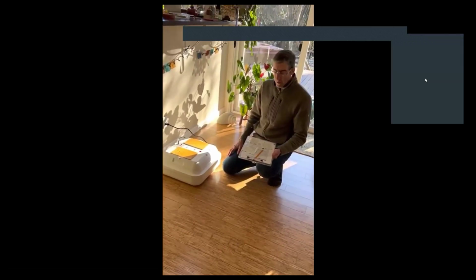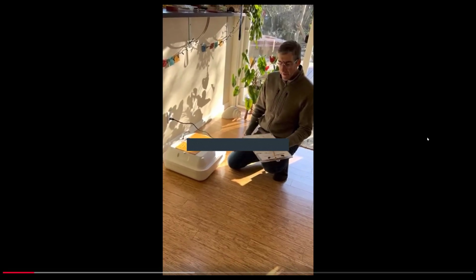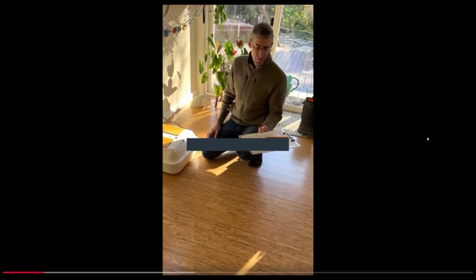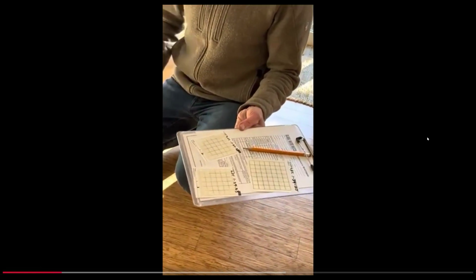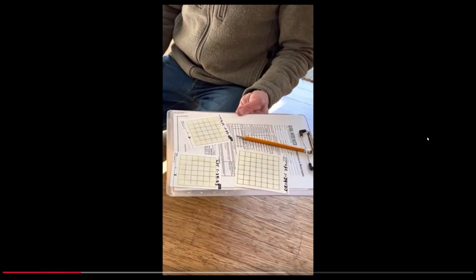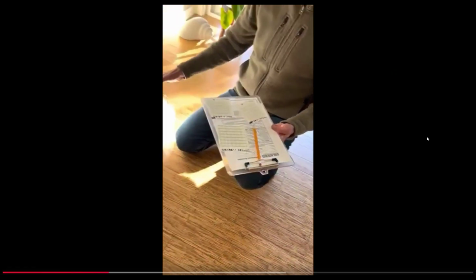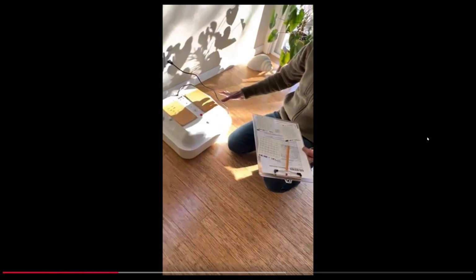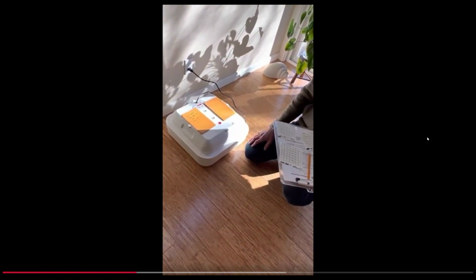Okay, now we have brought our sample into the incubator, and I have two different sizes of R cards. Typically you're only going to use one size, either the 1 ml or the 3 ml card. I just happen to use two different sizes for training purposes so we could demonstrate the different ones. I've got my incubator, which is preheated to anywhere between 29 and 37 degrees Celsius.